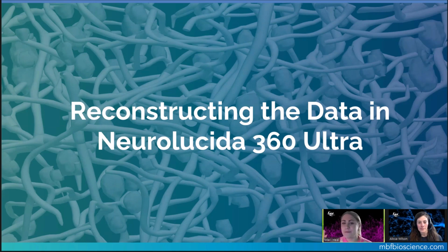Great. So we've used our ClearScope to generate all this data. What can we do with all of it? And today we're going to talk about how Neurolucida 360 can be leveraged to reconstruct both the neuronal and the vascular morphology from both of those channels that Alissa was talking about. And you can use this tool set to answer unique and specific experimental questions. And we're really excited to show it to you today.